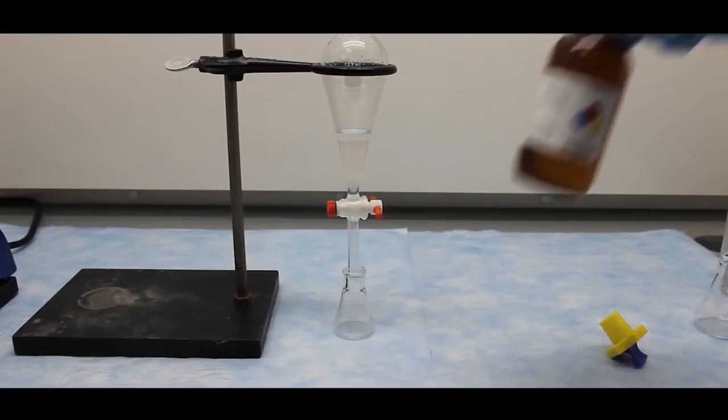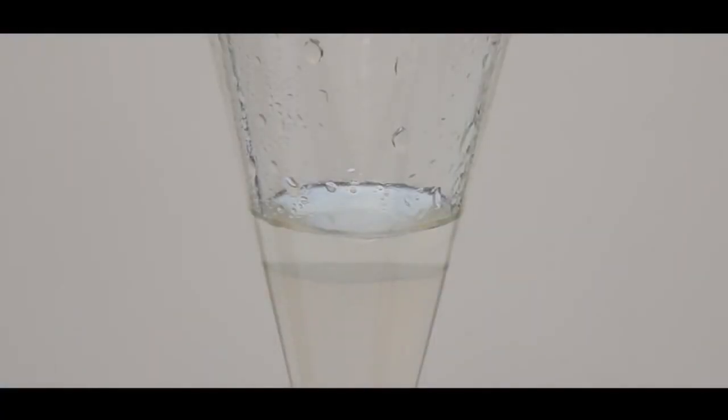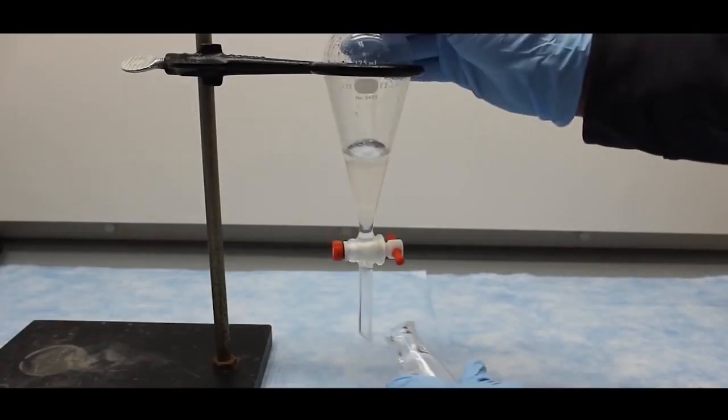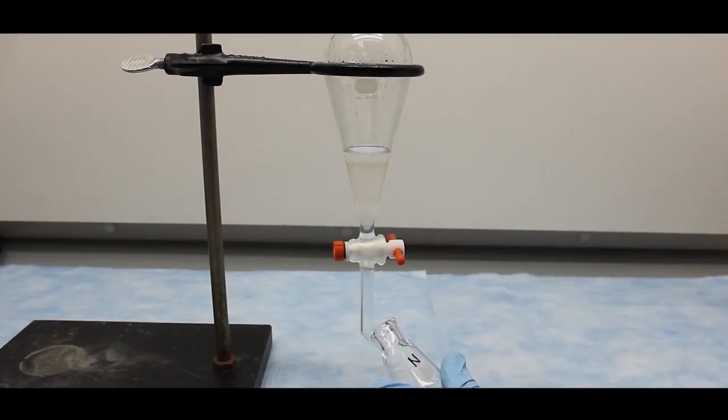To be safe, I'm going to add a few more drops of DCM and watch where they go, so I know which layer is the DCM layer and which layer is the aqueous layer. You can see the drops fall to the bottom. This makes sense because DCM has a greater density than water and is usually the bottom layer. So I'm going to label this bottom flask with an N, which will be the neutral organic dichloromethane layer.